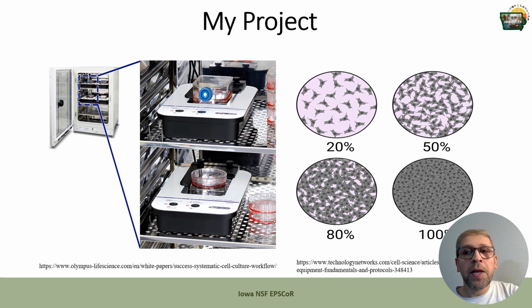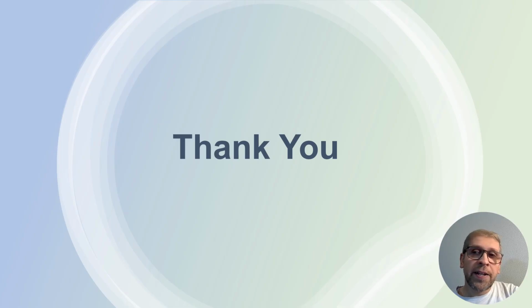For example, we can take some samples and observe them under a microscope, but we are looking for some inline techniques to monitor cells in terms of their size, their count, and their shape during the cultivation process. Hope you enjoy my presentation, and thank you.